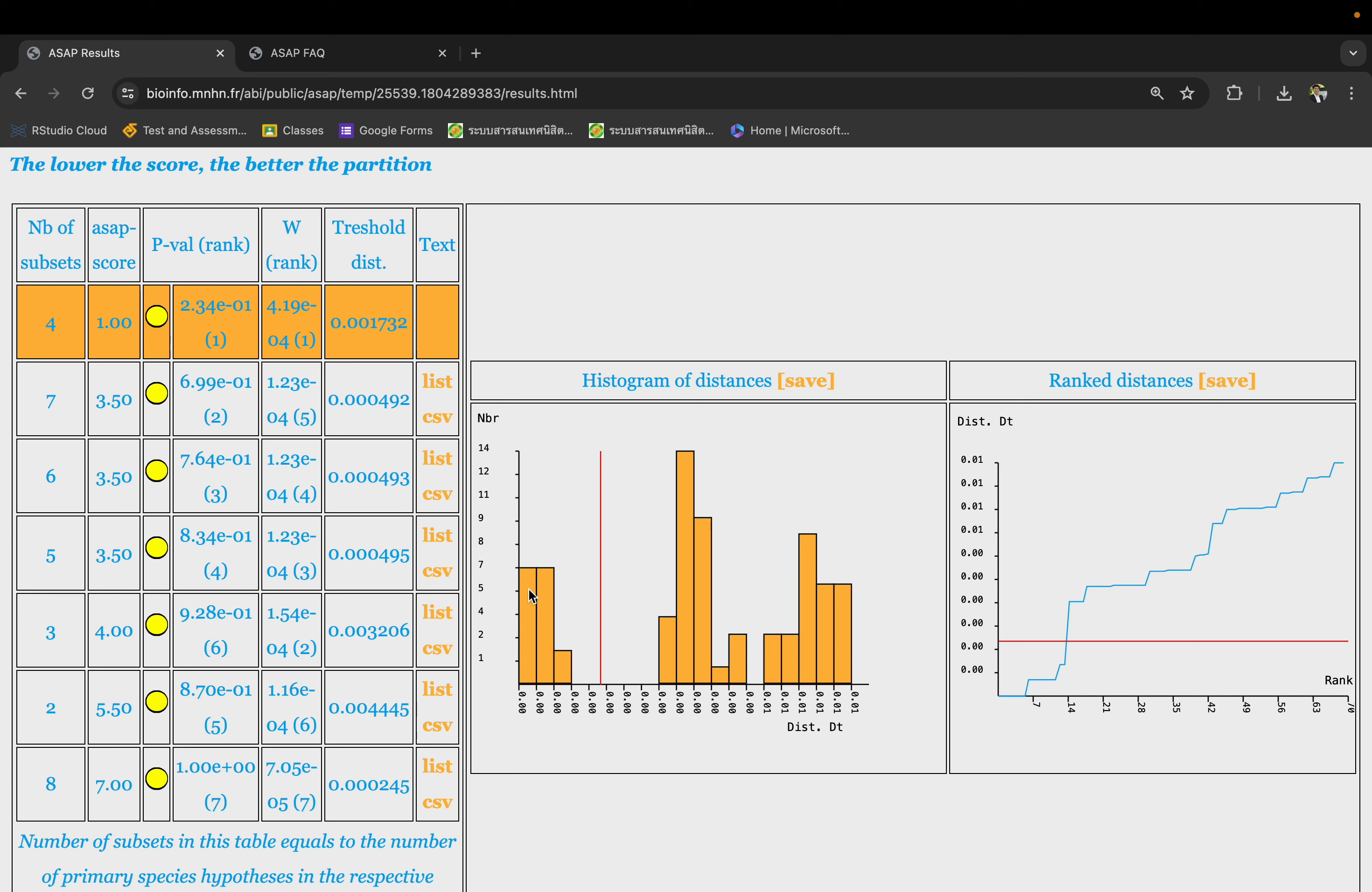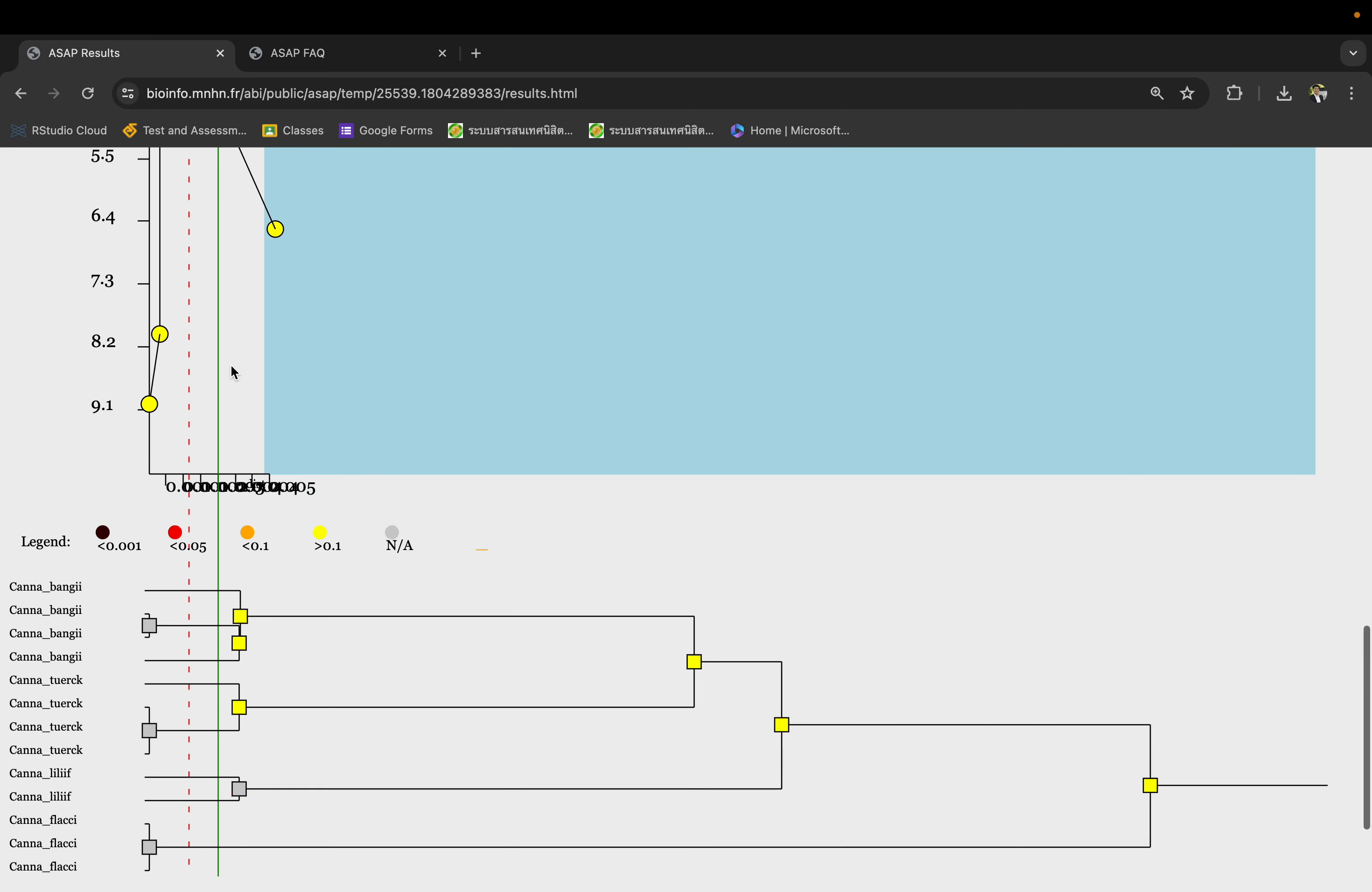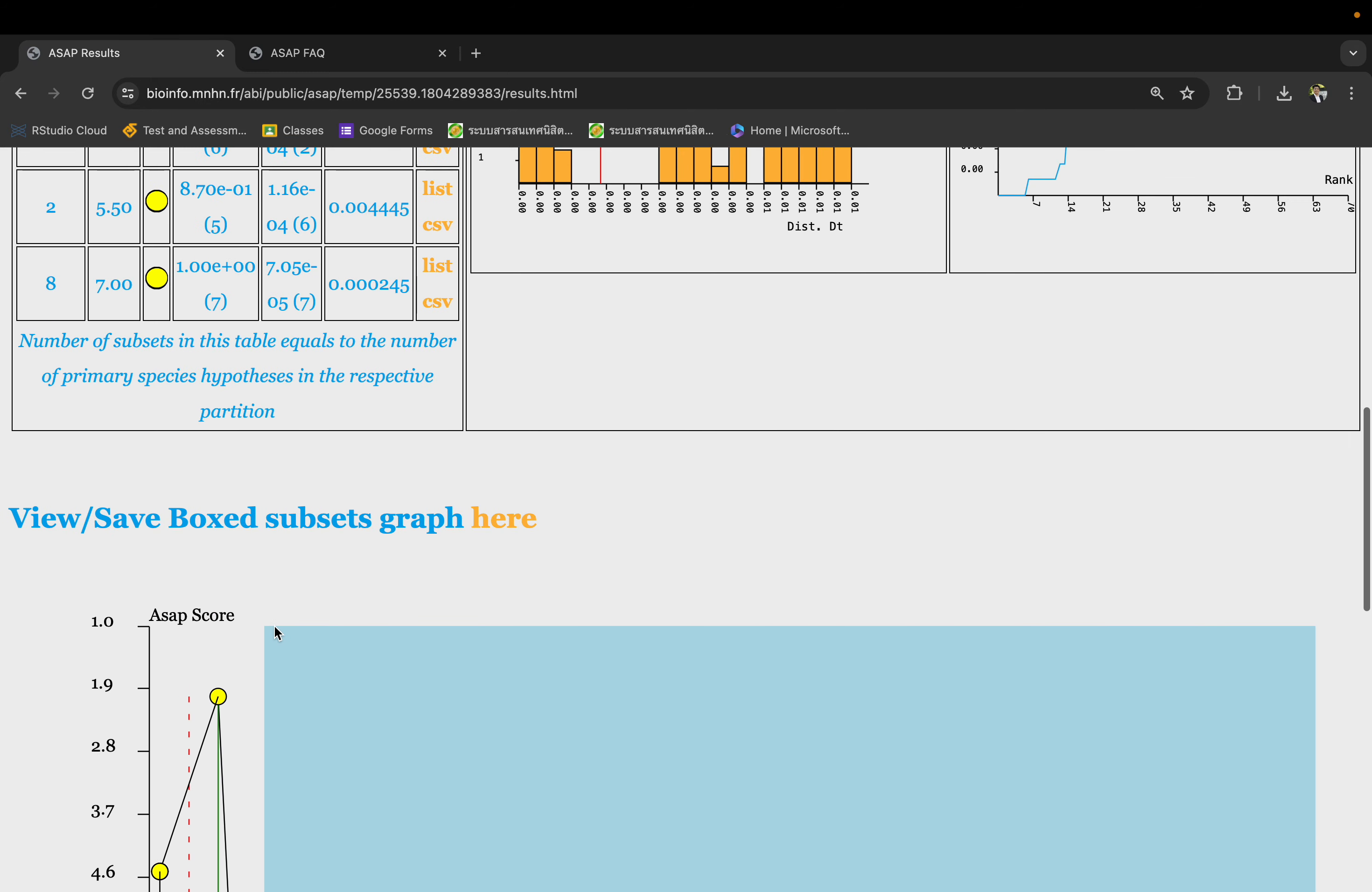This is the distance among sequences of supposedly the same species, and this is the distance between species. You can look at the graph here. This shows the best ASAP score of 1 is over here, and this is where you separate into four species: 1, 2, 3, 4. Which is right around here for ASAP score equals 1. This is a bit hard to look at.